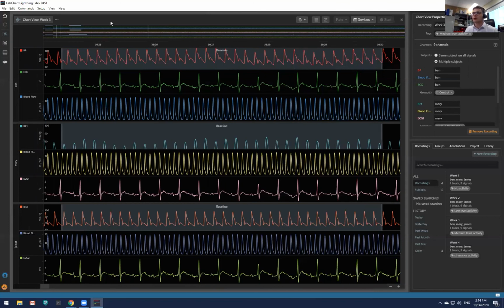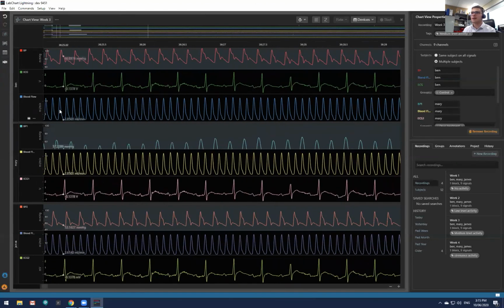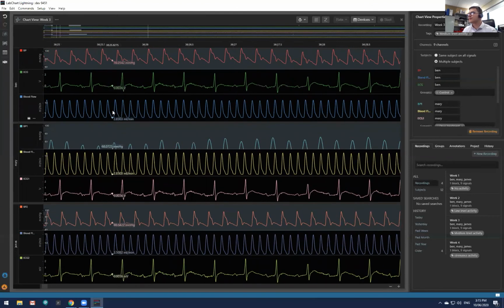So what this shows you is that you can import, we can have a trial set up for you straight away today. You can import your data, you can have a play with it. It's an excellent tool for cross-analysis of your data. It's really easy to do calculations. It's easy to overlay. It has so much potential when it comes to integrating new serial devices. And it's a really simple and easy way to look at your data. And please just have a go of it. It's absolutely a fantastic tool.